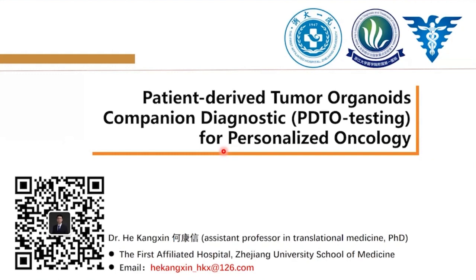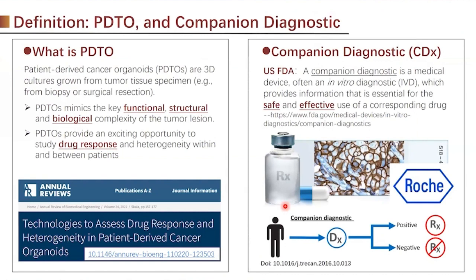Today, I'm going to introduce patient-derived tumor organoid (PDTO) companion diagnostic testing for personalized oncology. In the first slide, I would like to briefly introduce the concept of PDTO and companion diagnostics. Patient-derived cancer organoids, PDTO, are 3D cultures grown from tumor tissue specimens from biopsy or surgical resection.